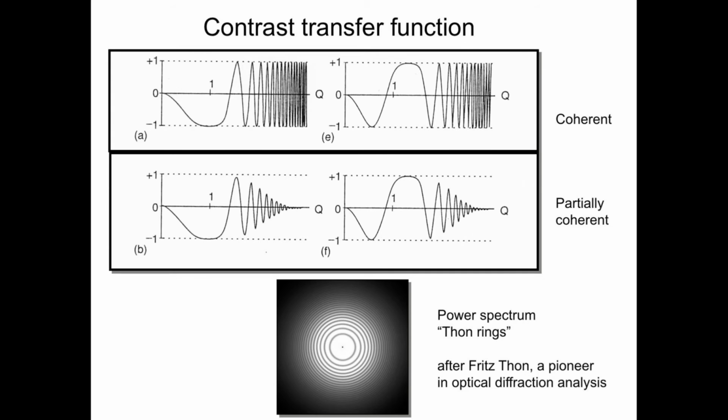And the first of these intervals is the so-called Scherzer focus. I think this is actually Scherzer focus, and it's named after Scherzer, who's been very involved in developing the ideas of image formation in electron microscopy. So you can see that here we have the first such area, and then here's the second one. So they're distinct defocuses in which we always get this kind of interval.